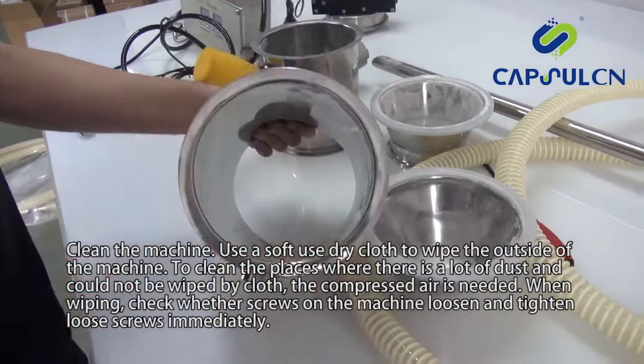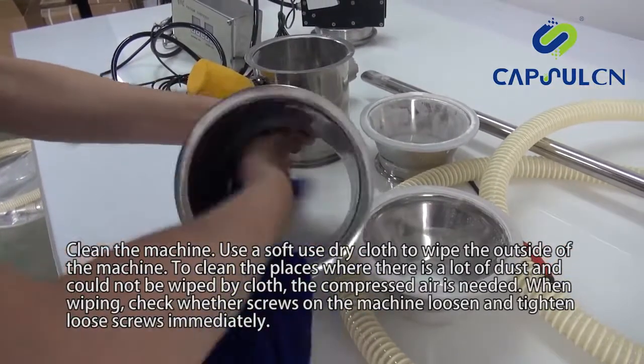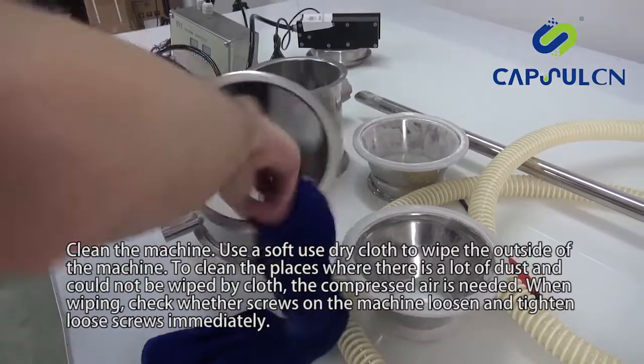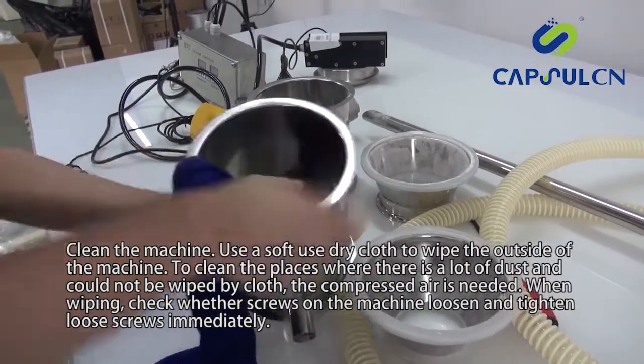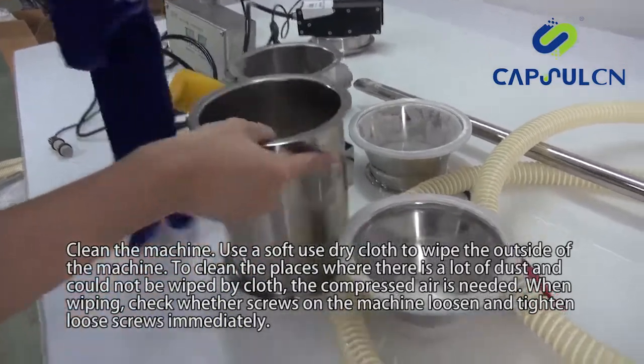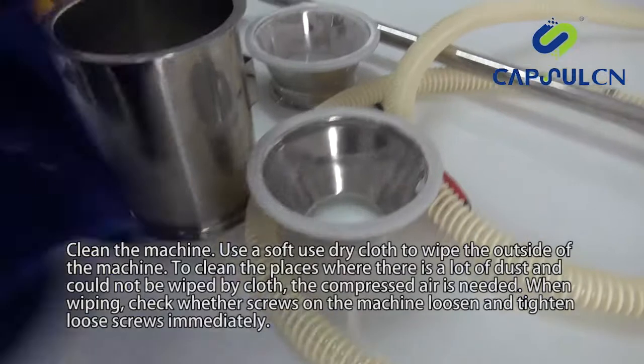Clean the machine. Use a soft, dry cloth to wipe the outside of the machine. To clean places where there is a lot of dust that could not be wiped by cloth, compressed air is needed. When wiping, check whether screws on the machine are loose and tighten any loose screws immediately.